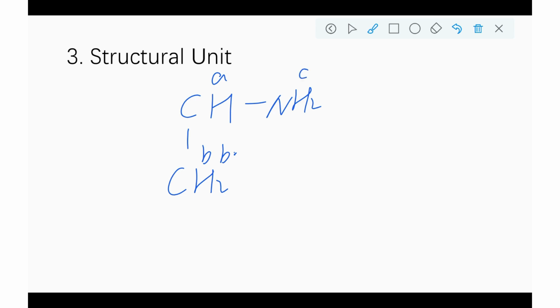And this is hydrogen C. So hydrogen A is going to be coupled with hydrogen C and hydrogen B. And hydrogen B and C are not equivalent, so by the n+1 rule, it is split into 2 plus 1 multiplied by 2 plus 1.